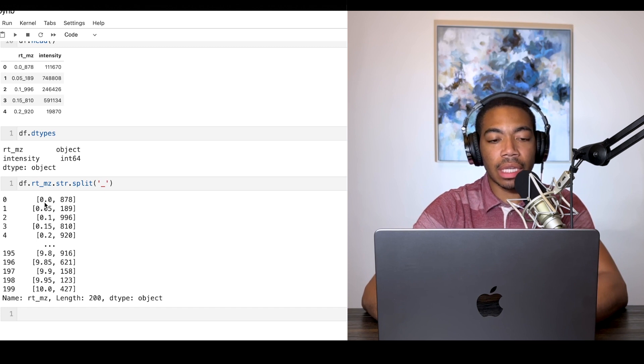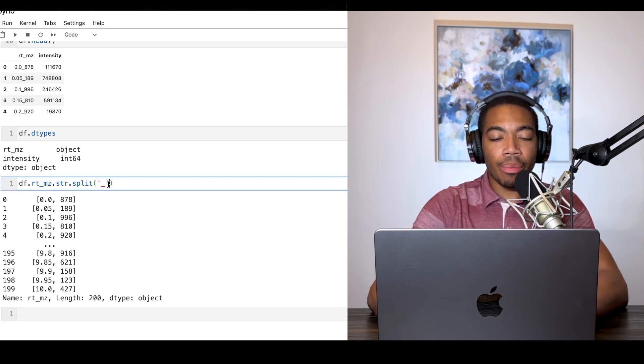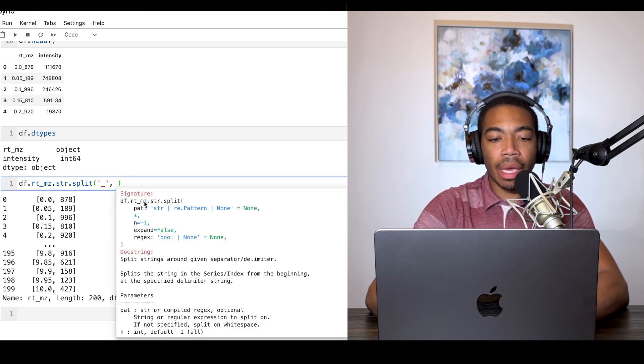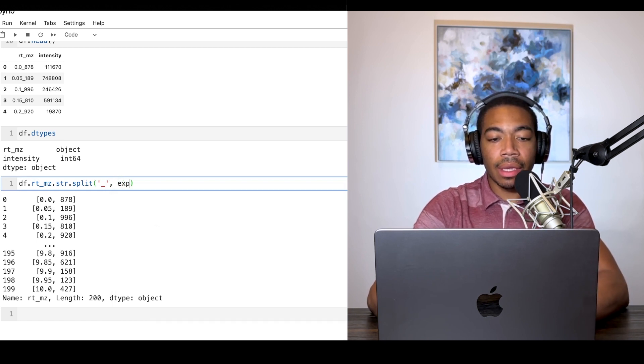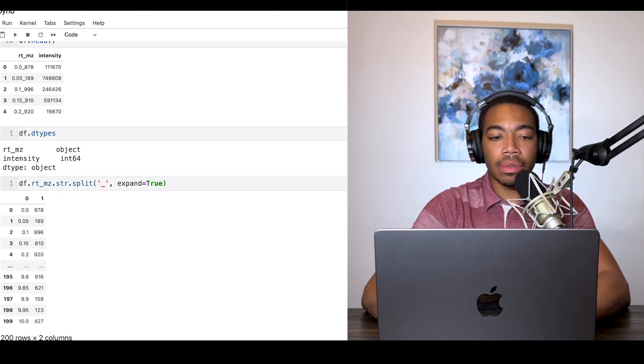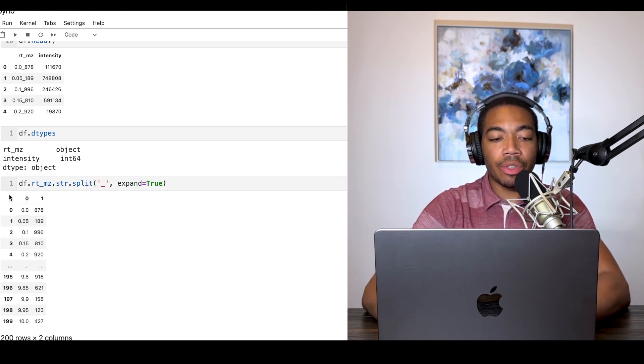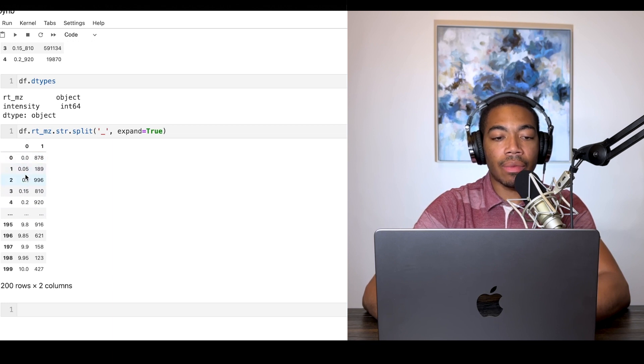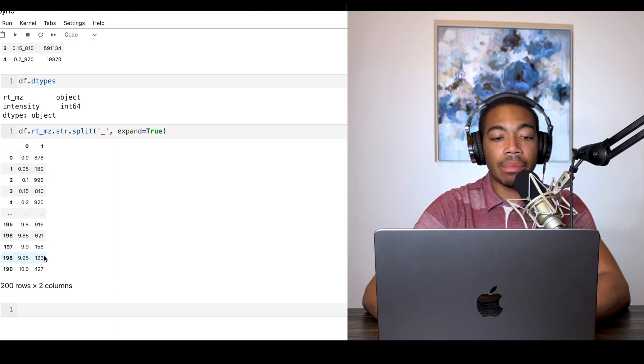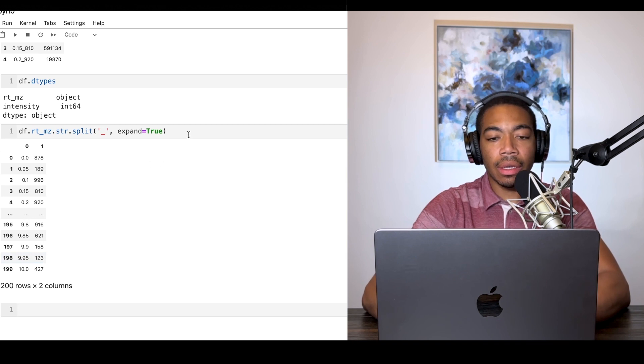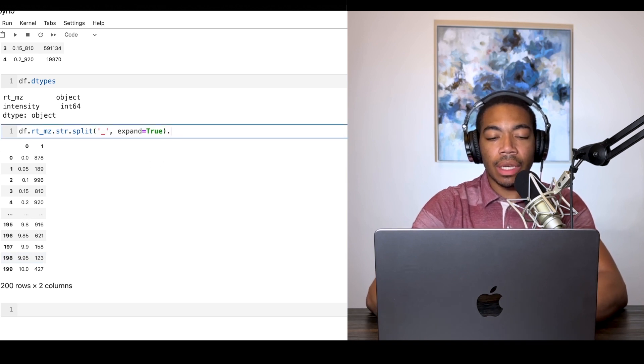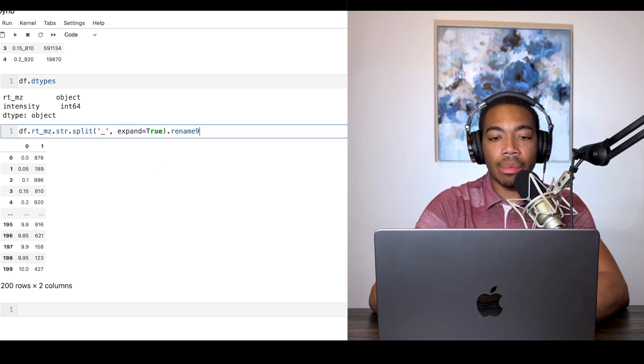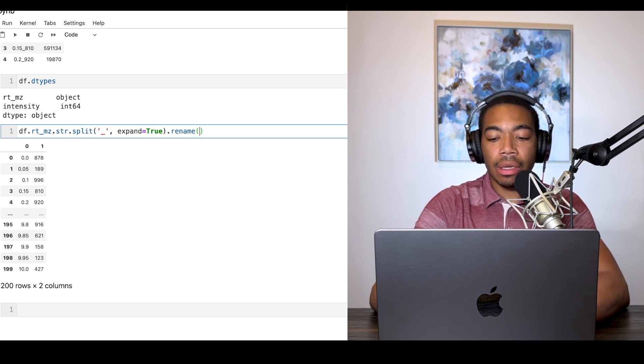When we run this we get a list for each element where the left is retention time and the right is mass-to-charge. But we have a secondary argument we can pass in called expand. When we run expand and set this equal to true, we generate two new columns where the left column is now retention time and the right column is mass-to-charge or m over z. We know how to rename those columns using the rename method and just chain that.